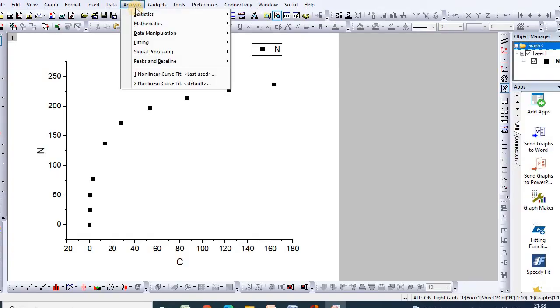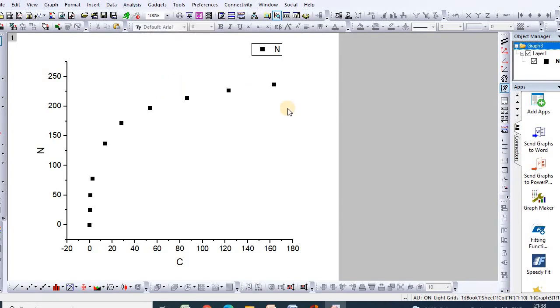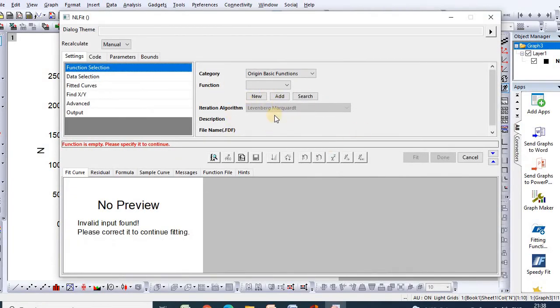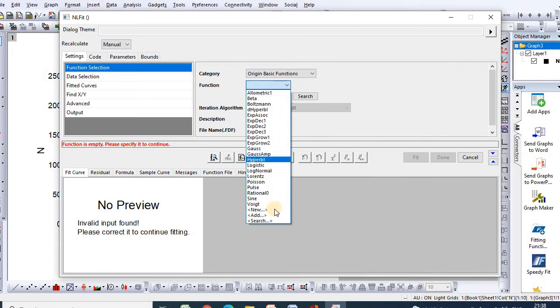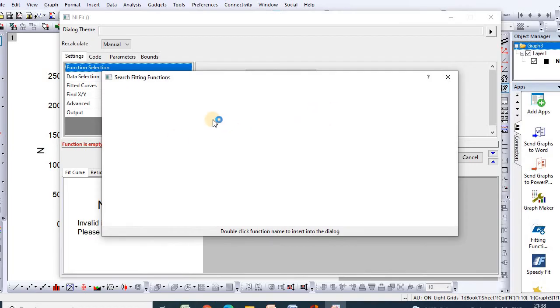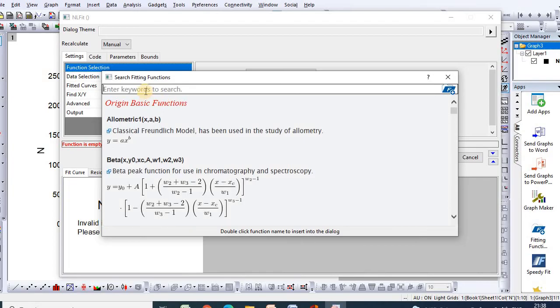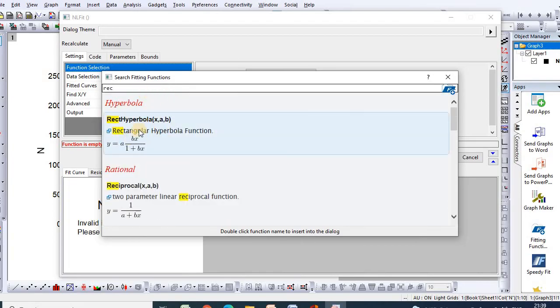Go to Analysis, then click Non-linear Curve Fit Default. Here is your function dialog. Then click Search — a search box will appear. Type 'rect' to search, and here is the rectangular hyperbola function.